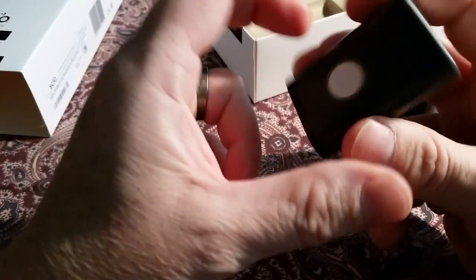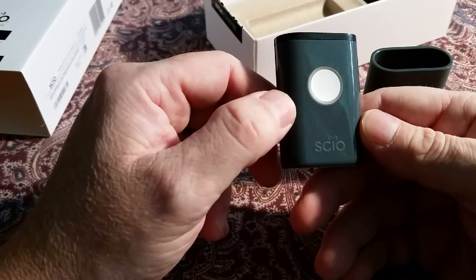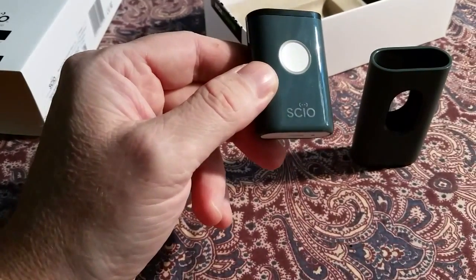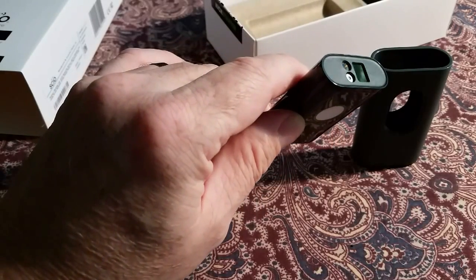This is the all-in-one button. It handles charging, on/off, battery condition, and scan timing when it's scanning. It feels very good, very nice.